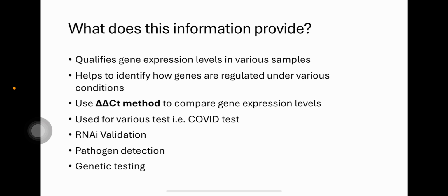What does the information provide? It helps us quantify gene expression levels in various samples. It allows us to identify how genes are regulated under different conditions. It allows for various testing revolving around the realm of pathogen detection, i.e. COVID tests, RNAi validation, and genetic testing.